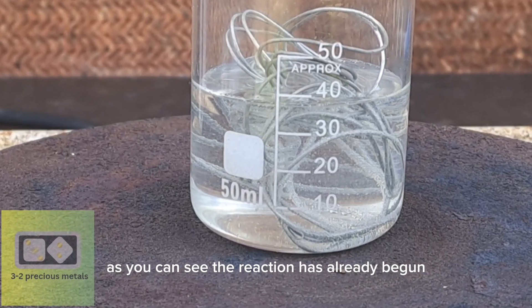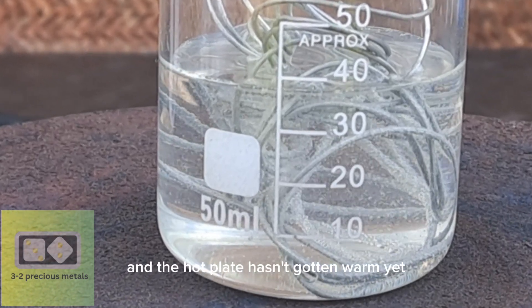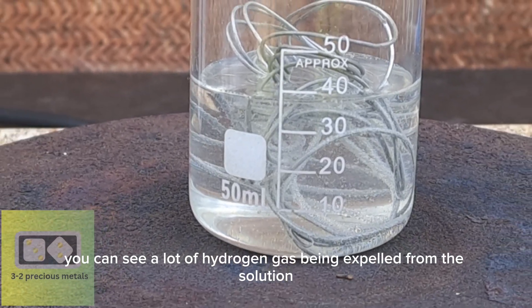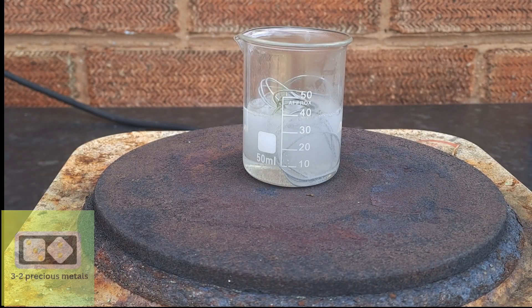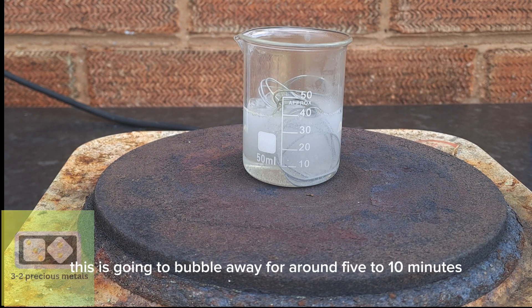As you can see, the reaction has already begun, and the hot plate hasn't gotten warm yet, but already you can see a lot of hydrogen gas being expelled from the solution. The reaction has really taken off and is going to bubble away for around 5 to 10 minutes.